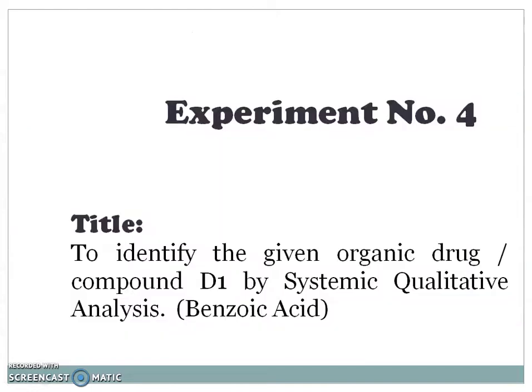Today we are going to deal with systemic qualitative analysis. Today's experiment is experiment number 4, titled To Identify the Given Organic Drug or Compound D1 by Systemic Qualitative Analysis, and the D1 compound is benzoic acid.